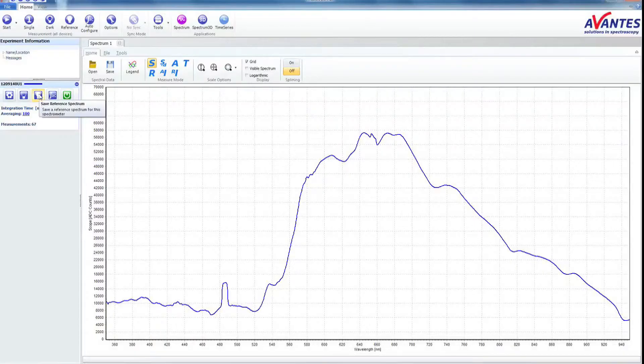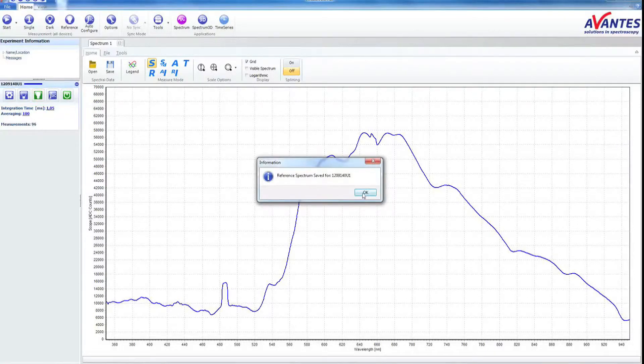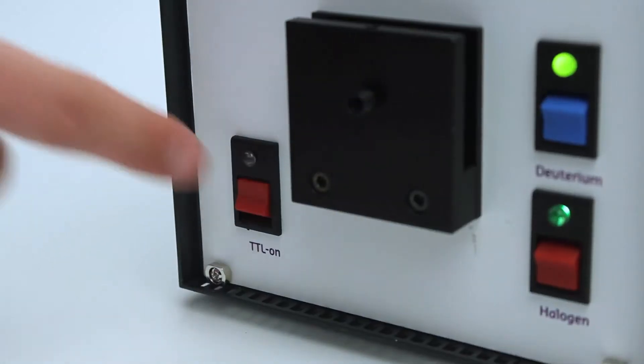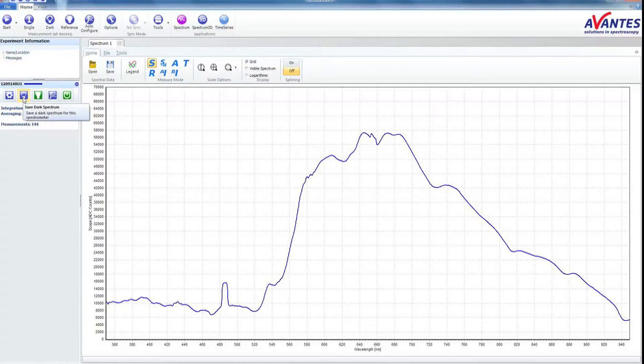Take a white reference and close the shutter. Wait until the spectrum normalizes. Now take a dark reference.